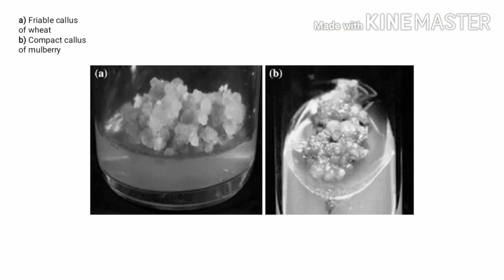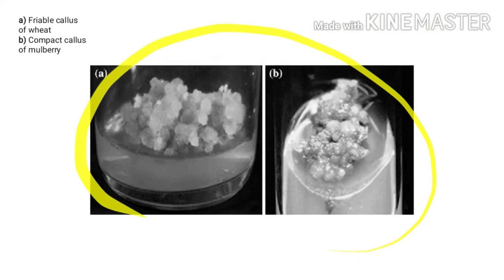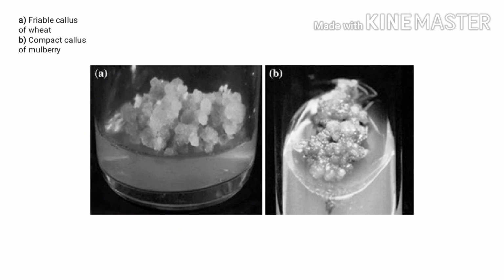Okay, all right, so you can easily see the difference between callus culture and normal cells. As I already told you, callus culture is just like tumor cells. It means there will be a bunch of cells, dividing cells here, highly unspecialized cells, undifferentiated cells, right?